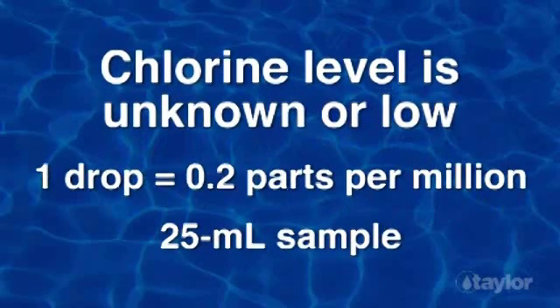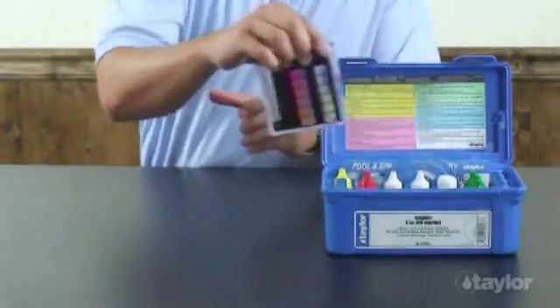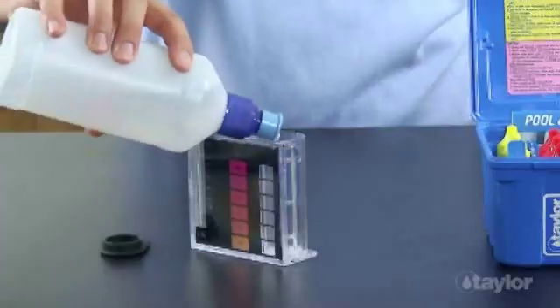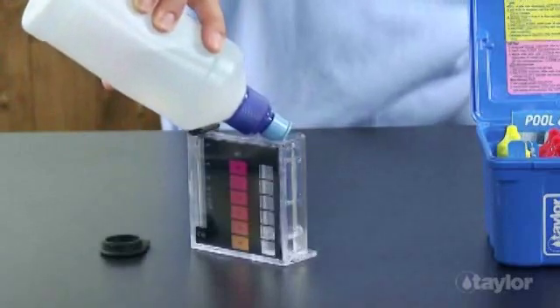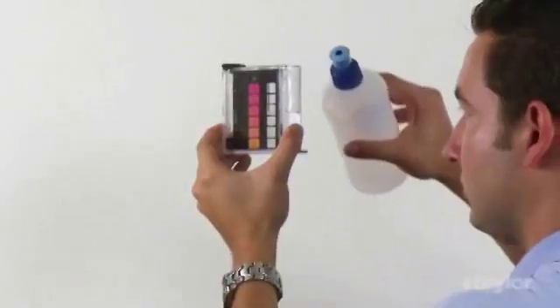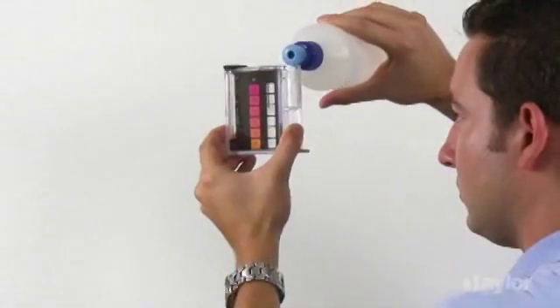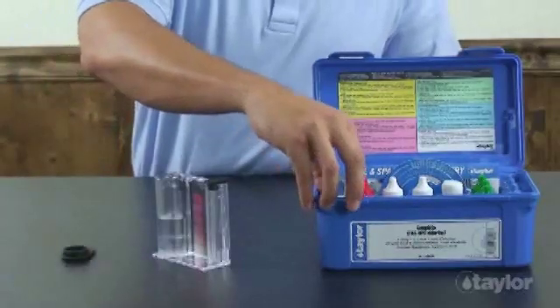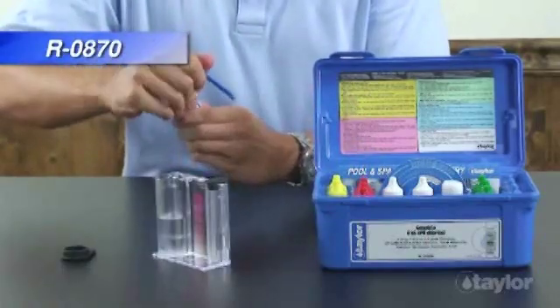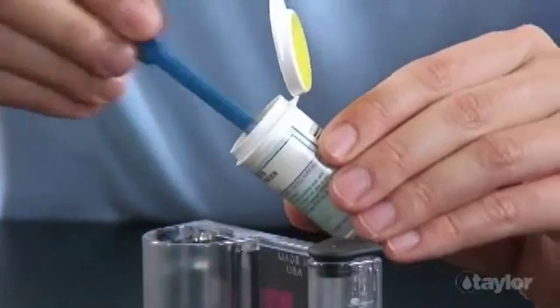This demonstration assumes the chlorine level is unknown. Rinse and fill the large comparator tube to the 25 mL mark with the water to be tested. Add two dippers of DPD powder. The scoop end of the dipper should be completely filled with the powder, but beyond this, a precise measurement is not necessary.